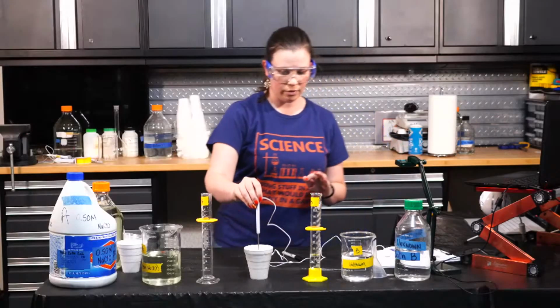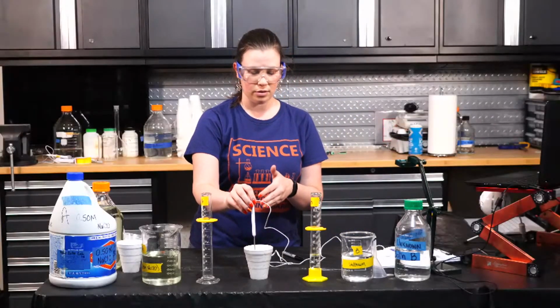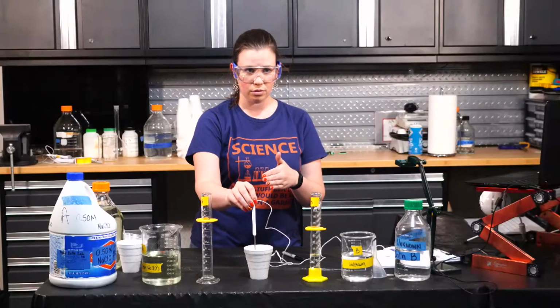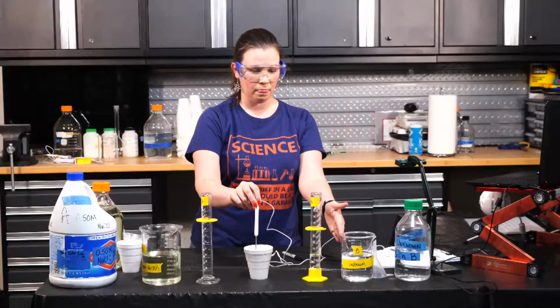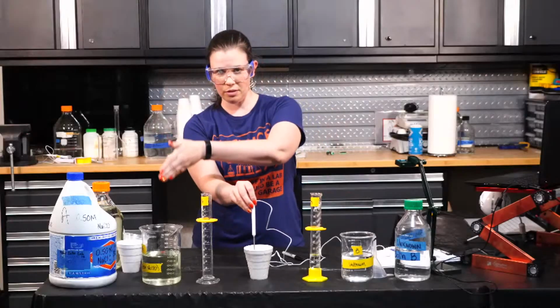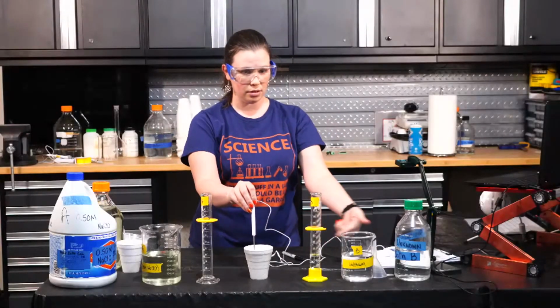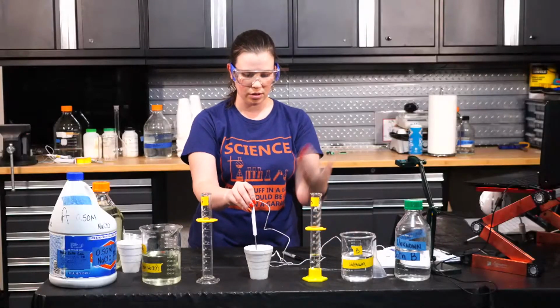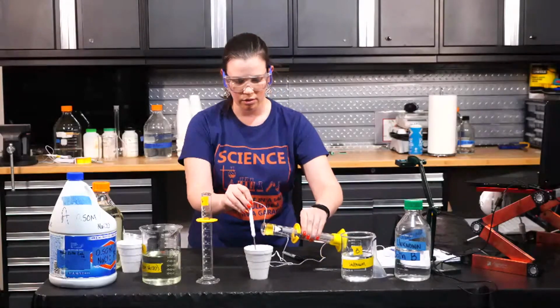So right now, the temperature of just the bleach is 19.0 degrees Celsius. Again, this is level 2, 19.0 degrees Celsius, before I've mixed solution B. Now, unknown B has been sitting at room temperature for the same amount of time as the bleach, so it would also be at 19. I don't want to pre-mix the solutions. I want to see the heat all at once. So here we go. We're adding unknown B.